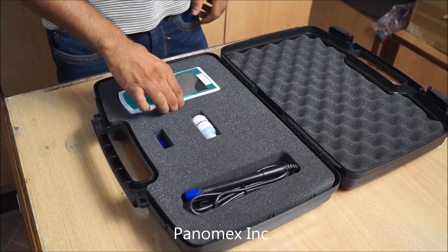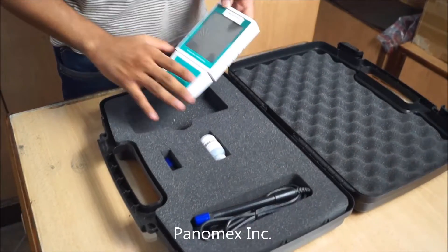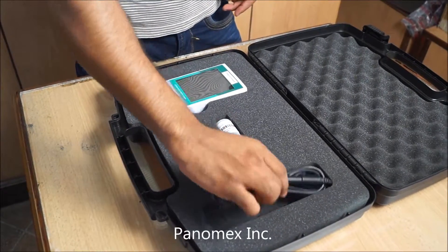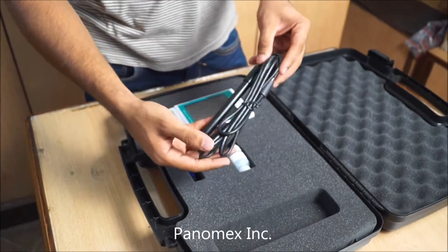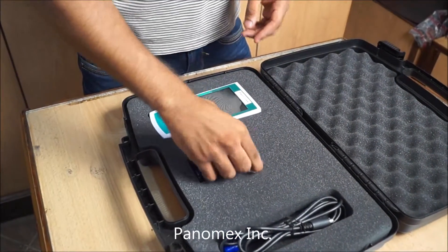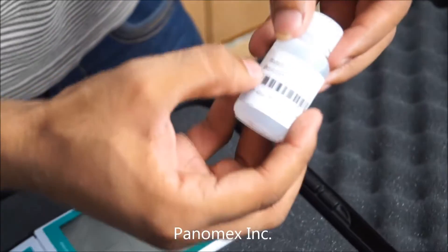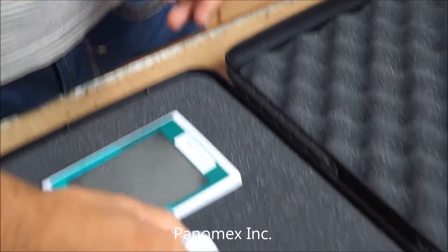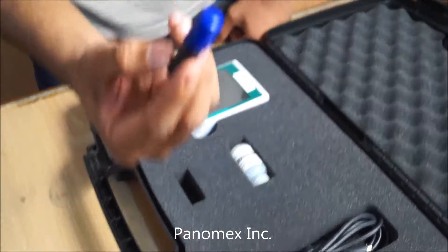The box contains one DO instrument, one DO probe, one Dissolved Oxygen Electrolyte Solution, and an extra probe cap.